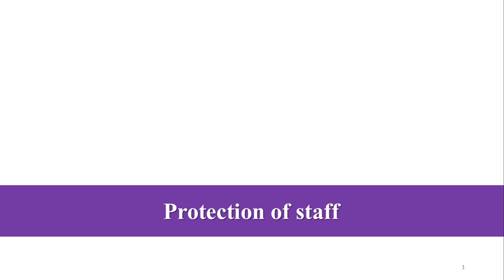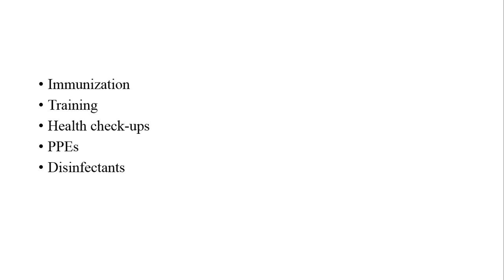Today we are going to learn about the concept of protection of staff working in diagnostic laboratories or medical microbiology laboratories. So there are various things which we can do to protect the staff from getting infections from various dangerous microorganisms which they are handling in the lab. So there are five major strategies for their protection.